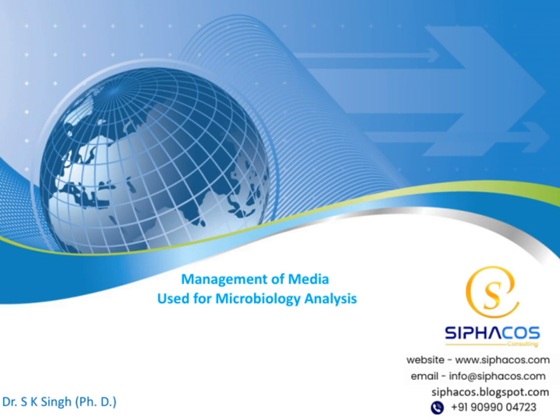Today, we'll be exploring the management of media used for microbiology analysis. Our focus will be on understanding the different types of media, their preparation, and their role in microbiological investigations. So, let's get started and see how these media help us in identifying and studying microorganisms effectively.